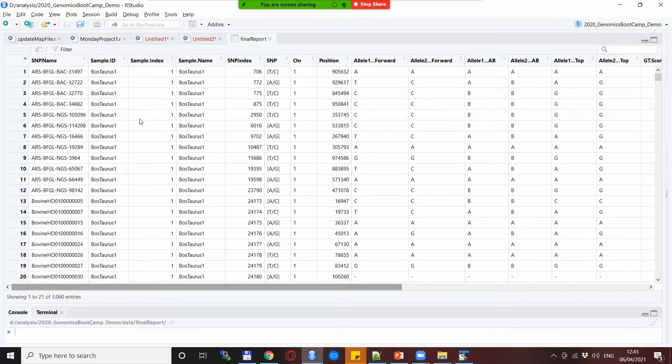When it comes to SNP data we have here the SNP name, the chromosome and the position.